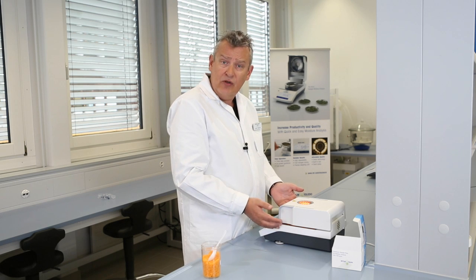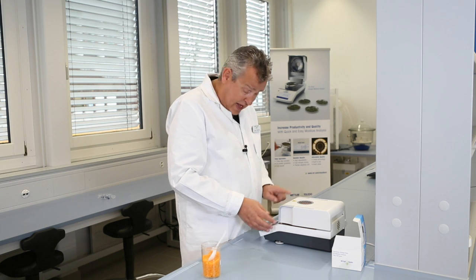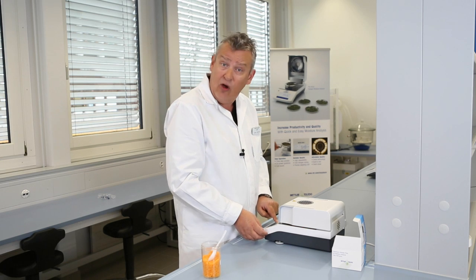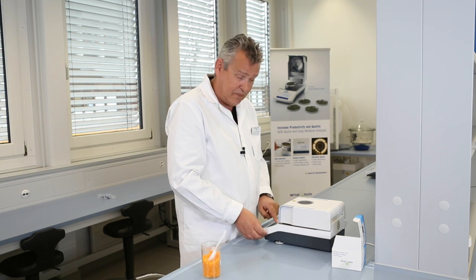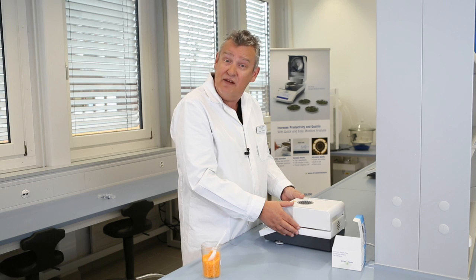The audible beep at the end of the measurement indicates that the measurement is completed, and the end result is now displayed on the screen. Congratulations, you've just performed your first measurement on the HE53 Halogen Moisture Analyzer.